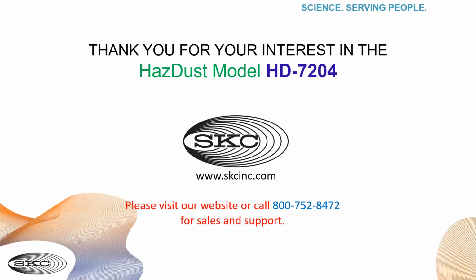It is a good idea to send it back annually for us to check it out, calibrate it, and clean it. But if it's not possible, you can verify the calibration, and you can also clean the optical sensor. A lot of times it might seem like it's out of calibration, but it could just be from a dirty sensor. So, if you're working in a more dusty environment, you would want to make sure that you clean that sensor more frequently.